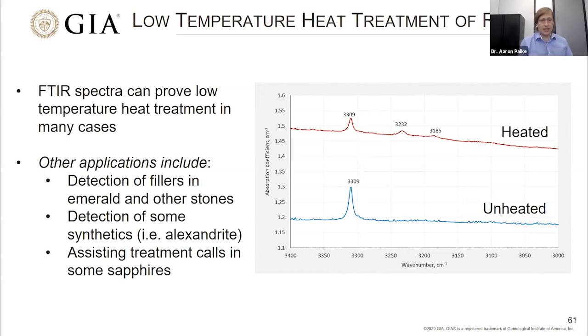But some other applications are detection of laboratory grown stones like Alexandrite and assistance in treatment calls for some sapphires, heat treatments in some sapphires, looking at these different water peaks that represent water dissolved in the sapphires.